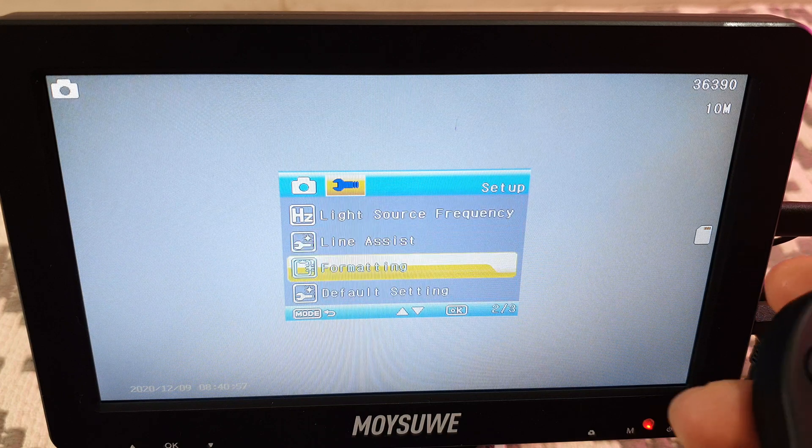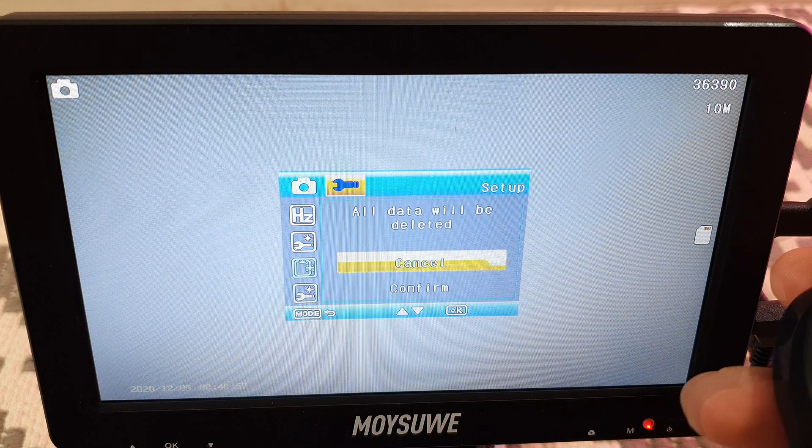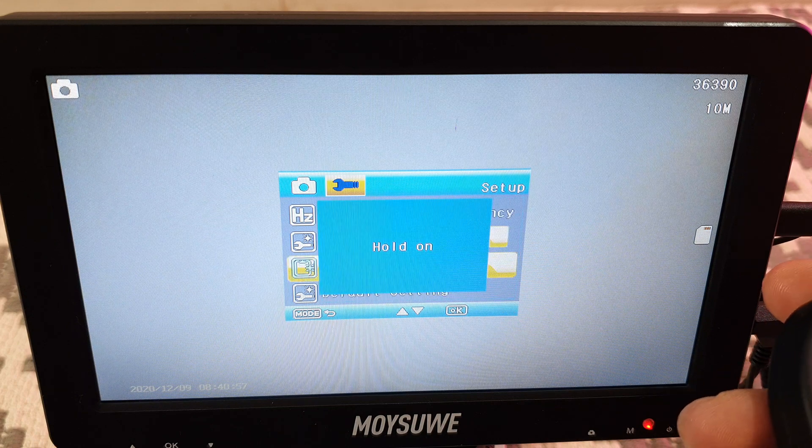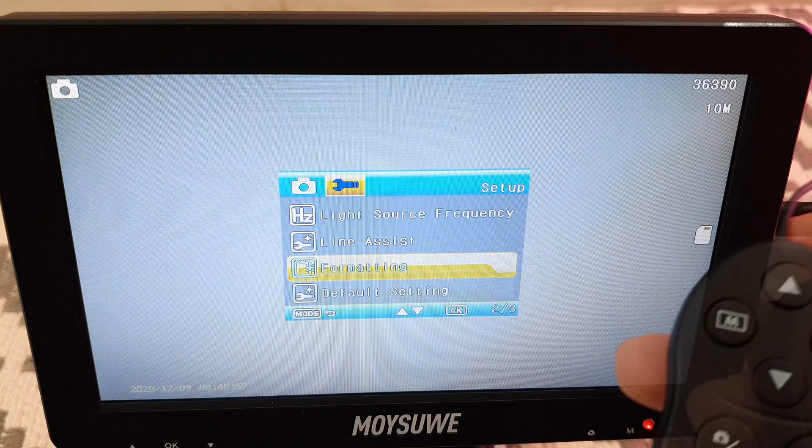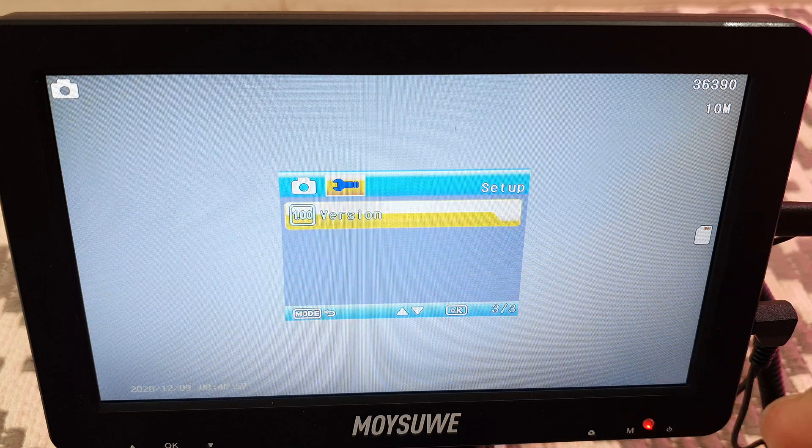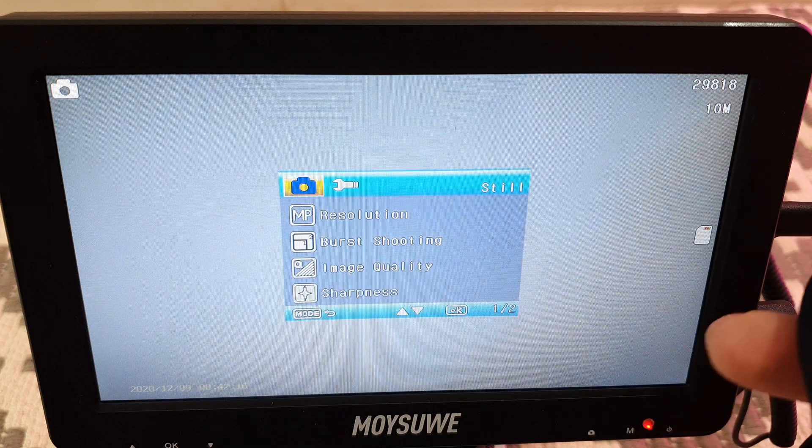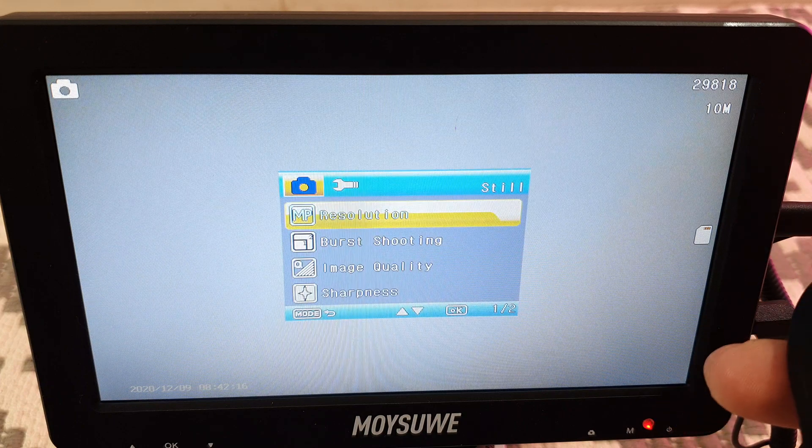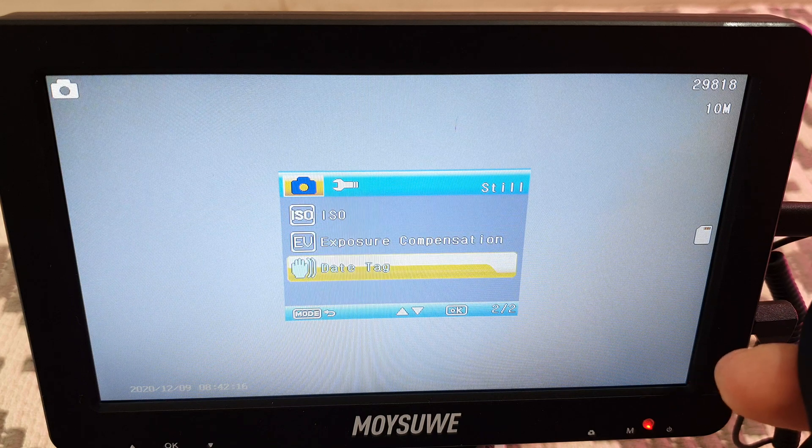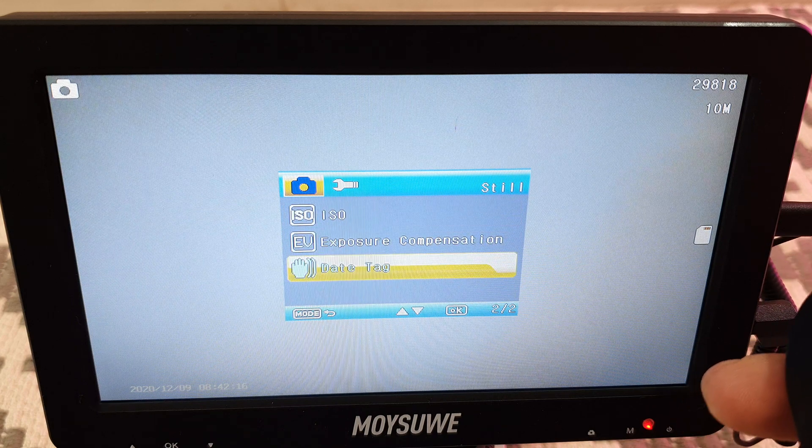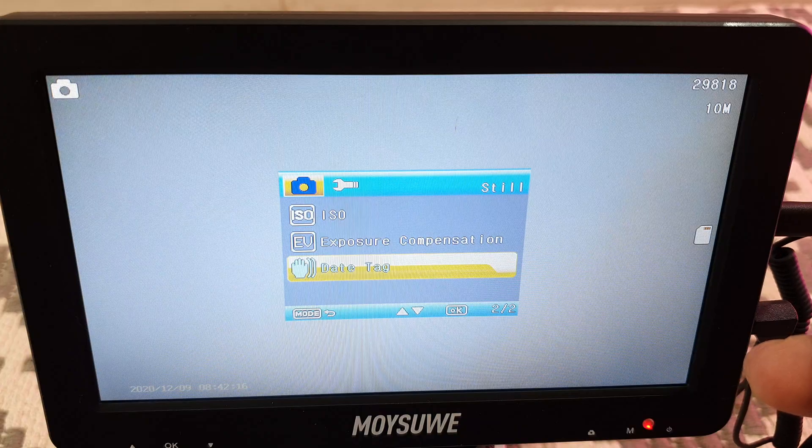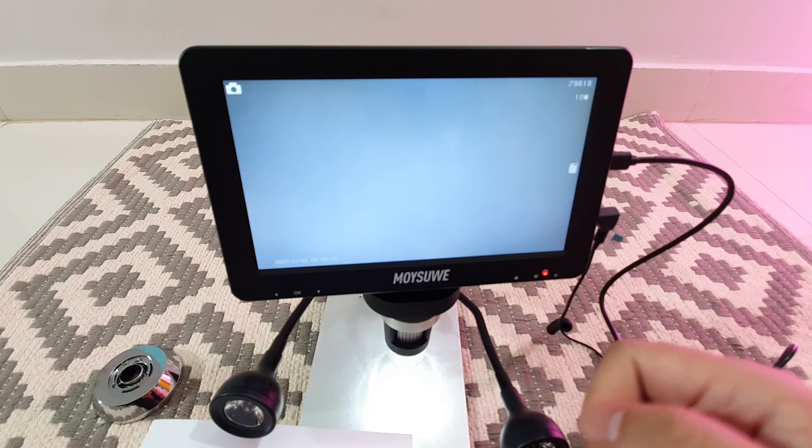And then of course language settings. There's a frequency light adjustment in case you have flicker. And there's something called as line assist in case you want grid lines. You can format the memory card here which I'm going to do now. It takes a bit of time for that and it's done. You can also set up defaults, also version module. You can actually check the version of this device. And that's about it. You can actually add date and time on this.